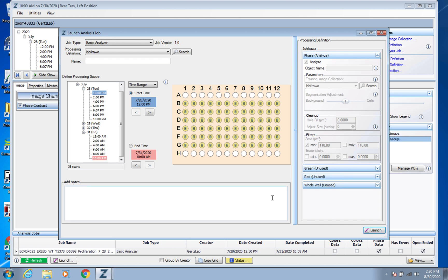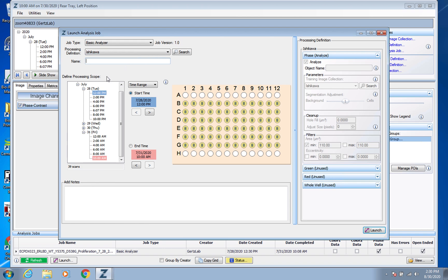This is assuming that a processing definition is already made for your type of cells. And of course here make sure that you title this analysis job something that makes sense. So if you're using a different processing definition you might want to state these were these cells from this date with this processing definition in the name, something like that.